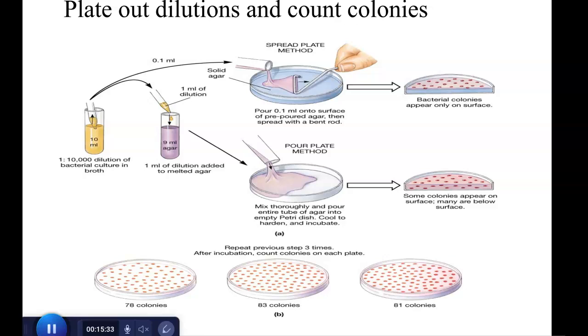The second thing is that this is going to allow us to capture the aerobic and anaerobic bacteria. Some that like the air are going to be growing towards the surface. Some that like it a little more anaerobic, that will shy away from the air, will grow inside the media. So it's just a better way of capturing all of the bacteria.